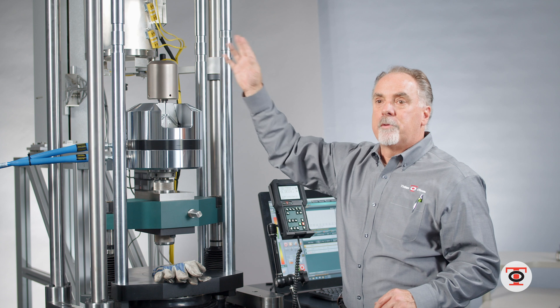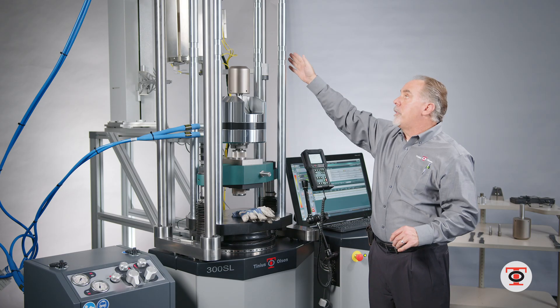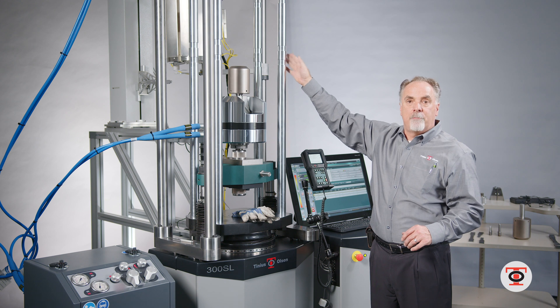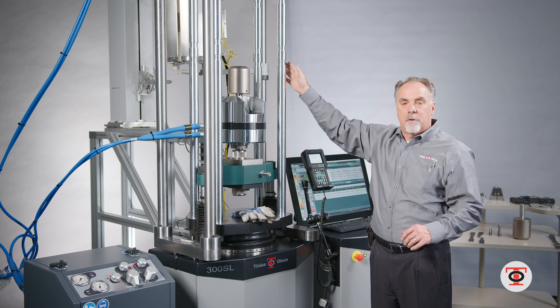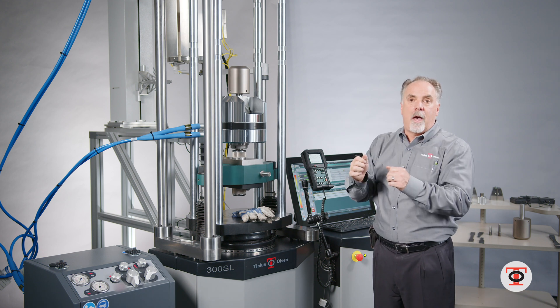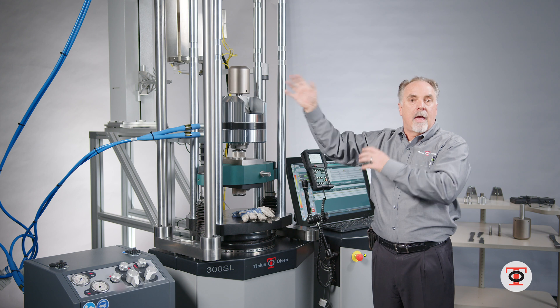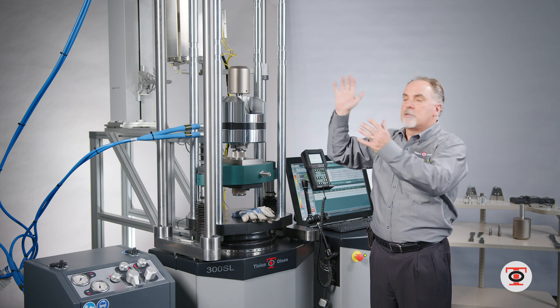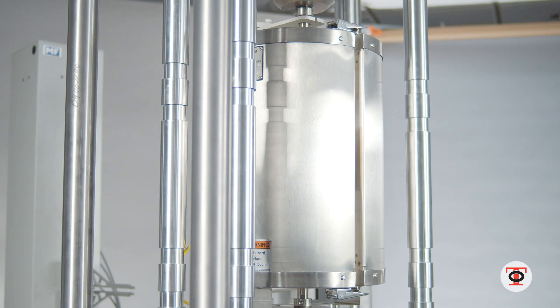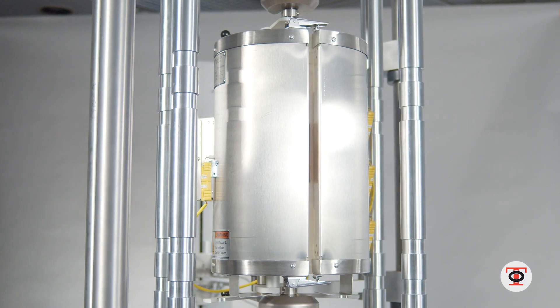I can have multiple furnaces on this frame at one time with the load train and sample soaking ahead of time, so while the test is going on the operator can swap out the load train with specimen and get the next one pre-soaking — swinging the furnaces in and out to get you the value that you're looking for out of the machine.